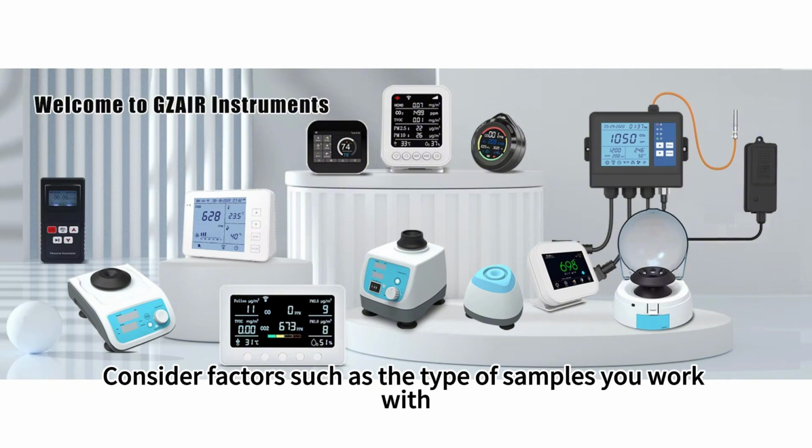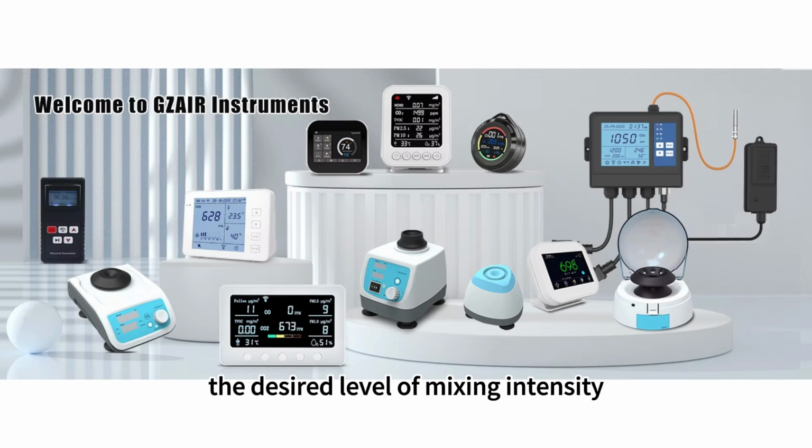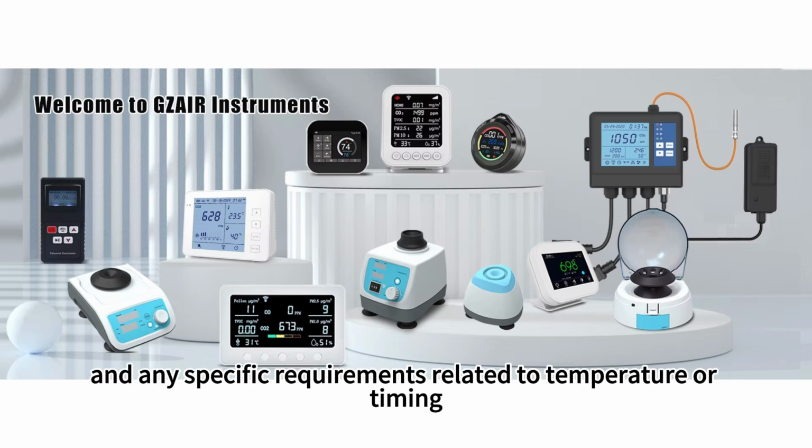Consider factors such as the type of samples you work with, the desired level of mixing intensity, and any specific requirements related to temperature or timing.